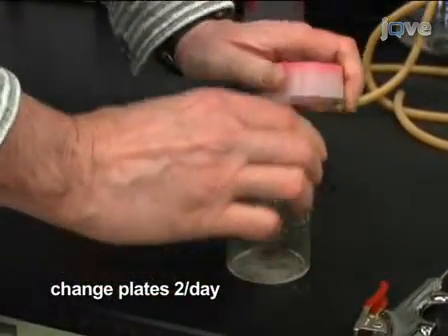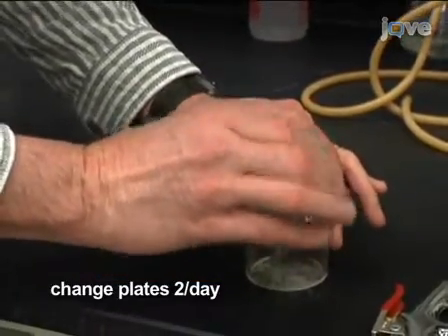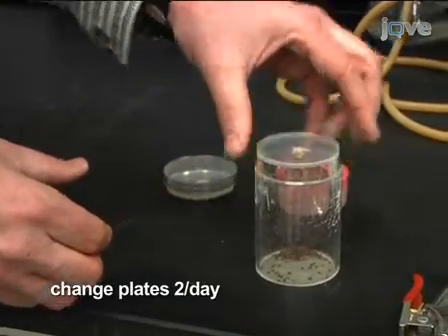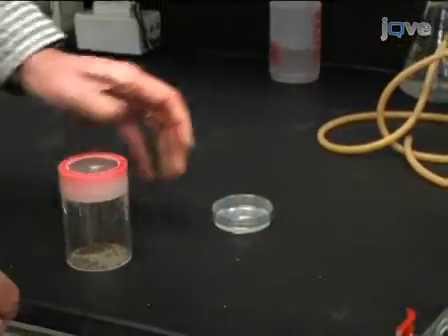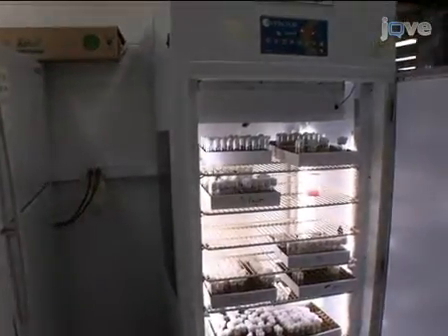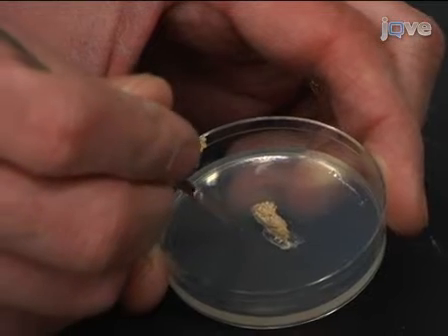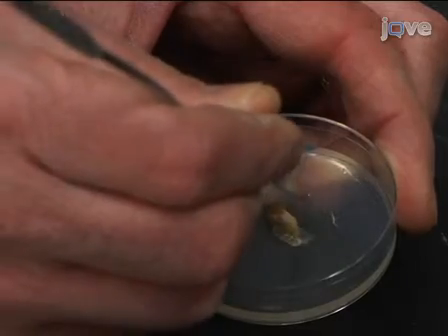Change the plate twice daily by tapping the flies off the plate and replacing with a new plate, then returning it to the incubator. By the third day, a good pot should produce 100 to 200 eggs per hour, with the highest egg output between dawn and late morning. To simplify collection, scratch or chisel a ridge into the collection plate auger — most eggs will be laid in or next to the scratches.